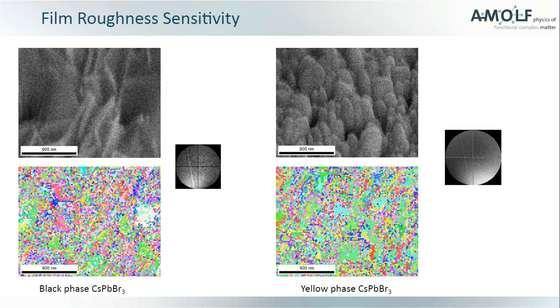At the left part, you can see a very large purple grain, which corresponds to the flake in the SEM. Basically, all these signals are from the top surface of these grains, because only there is the sample at exactly 70 degrees, which is perfect for EBSD, for the electrons to be reflected back to the detector.